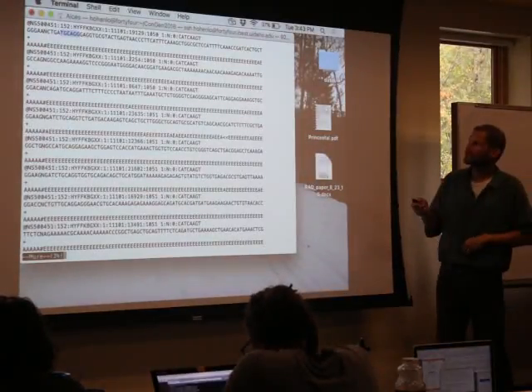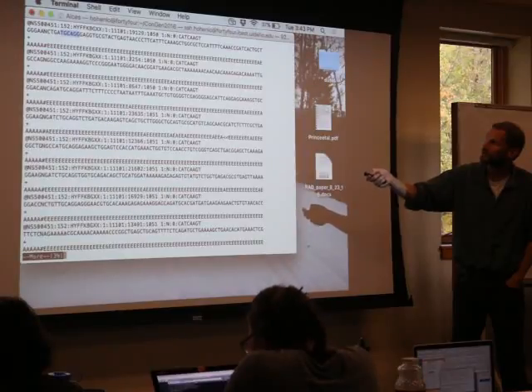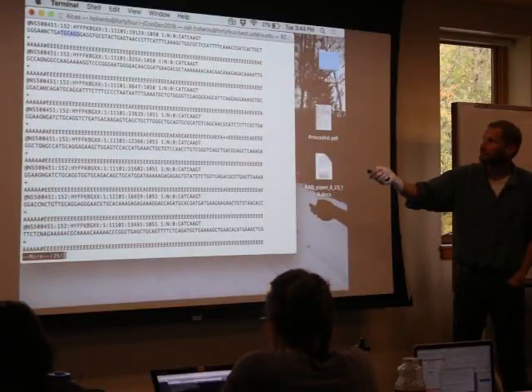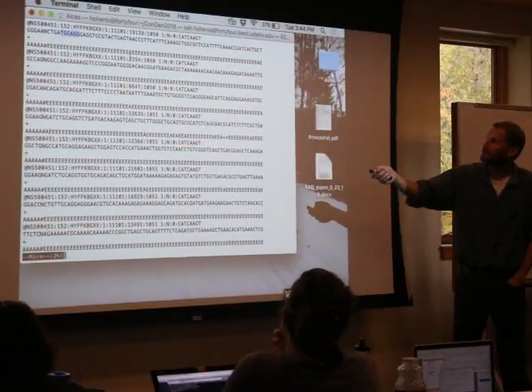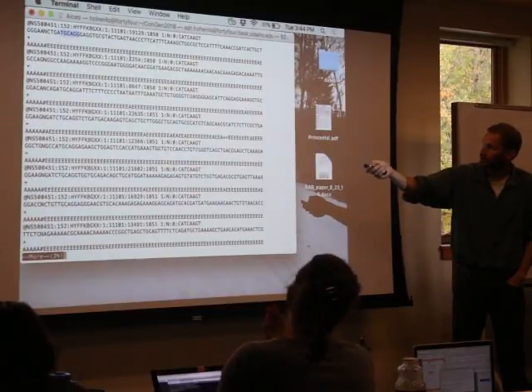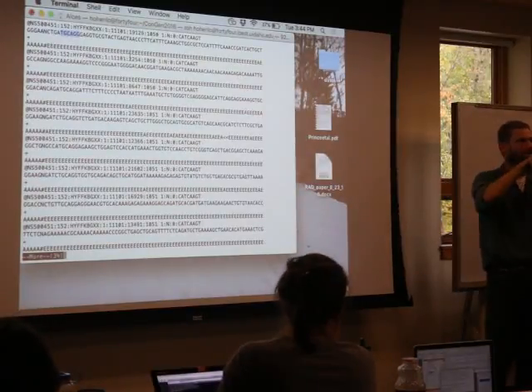But if you notice, this first read, that's the cut site there. This second read doesn't have anything resembling that. So hopefully, if it's a good read, which I don't think it actually is, but if it were, if you looked in the R2 file, the second read of the R2 file would have a correct barcode and TGCAGG. And then that pair would just need to be flipped.